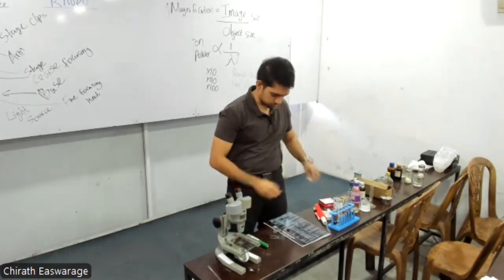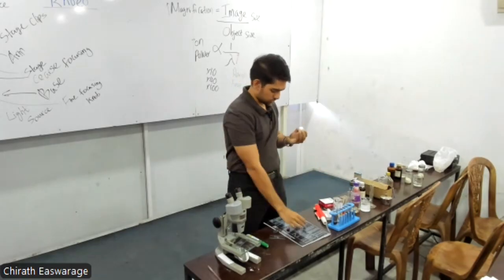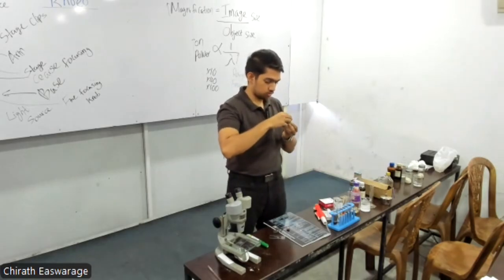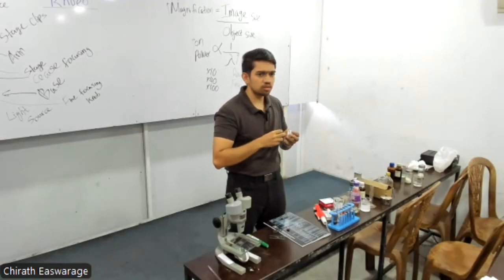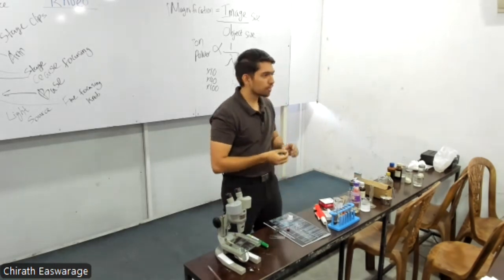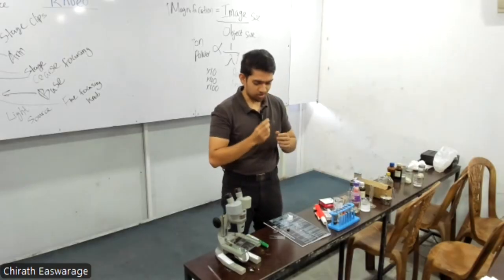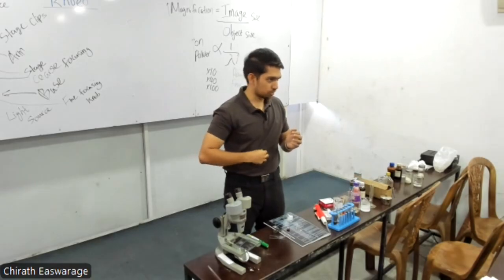So have you seen cover slips? You take a cover slip, and you're supposed to use a mounting needle to make sure that there are no air bubbles.